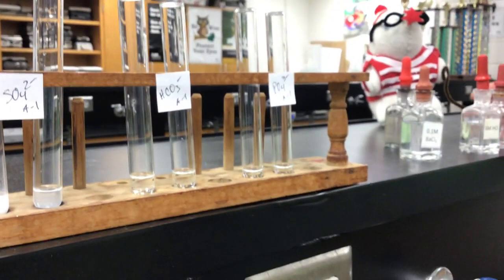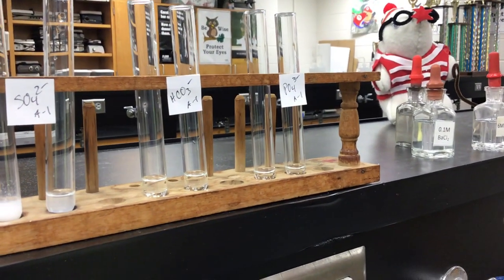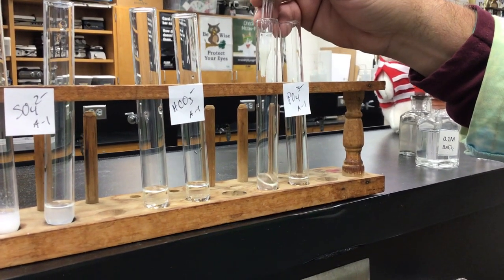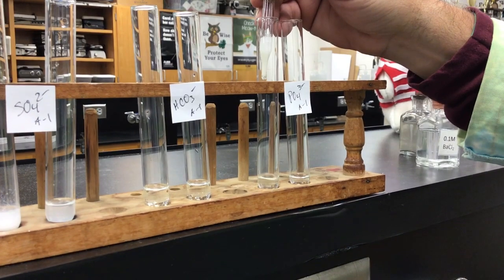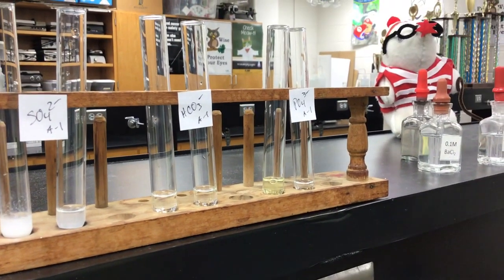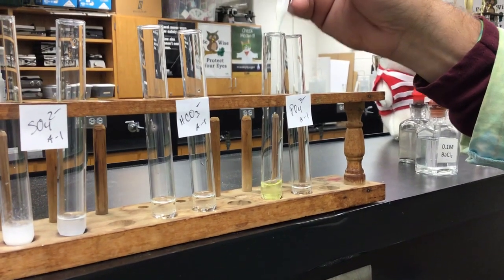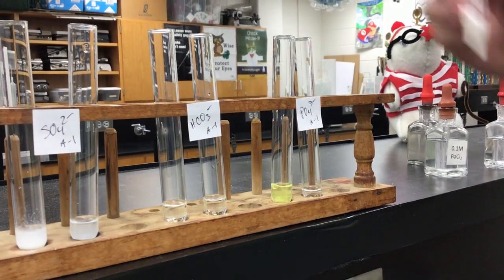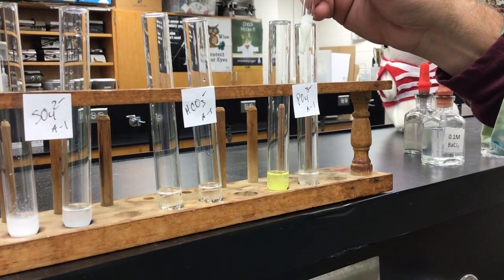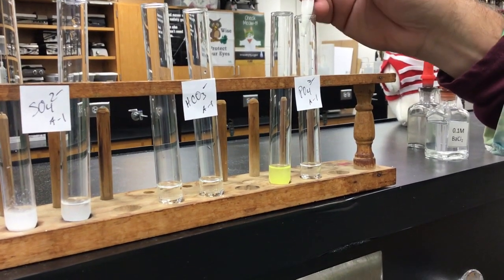And then the last one, we will add ammonium molybdate solution to test for the presence of phosphate. The first one is our known, sodium phosphate. I'm doing a better job counting this time than the other ones. 1, 2, 3, 4, 5. And now I'm going to add 20 drops to this one as well. More drops.